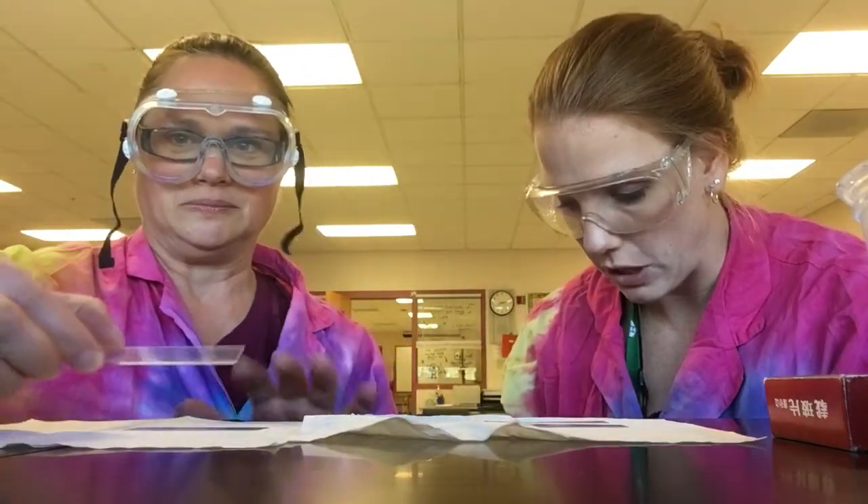Hi everybody, you told us to up the ante so we are. I'm Mrs. Christian, I'm Miss Shaw, and we're going to show you how to make dry mount and wet mount slides. First up, dry mounts. Dry mounts are pretty simple — the things that you need are a glass slide, a specimen, and another glass slide.